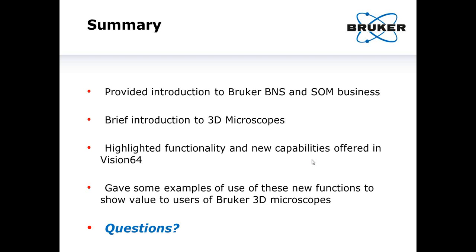And here's another question on roughness. Can you comment on VXI and how it affects roughness measurements? This VXI is a nice combined use of the spatial frequency information in the surface as well as the roughness information, and some enhanced algorithms for giving the data on the vertical scale.